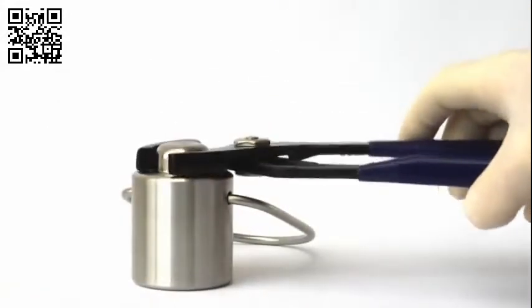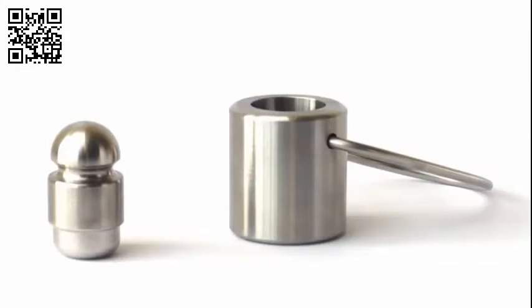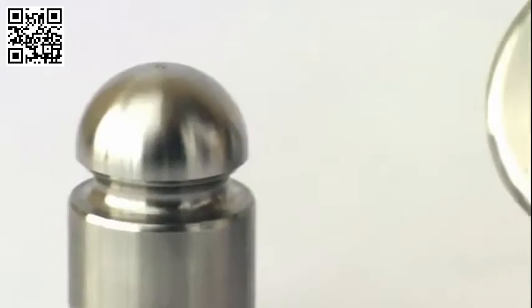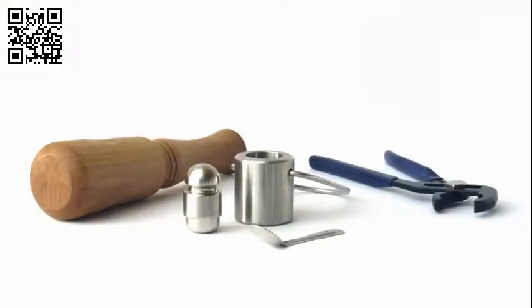The Cell Crusher is a device for disrupting tissue that has been frozen in liquid nitrogen. Its curved surfaces are designed for easy cleaning and effective sample recovery. The Cell Crusher kit includes a mallet, handling pliers, and two recovery spoons.